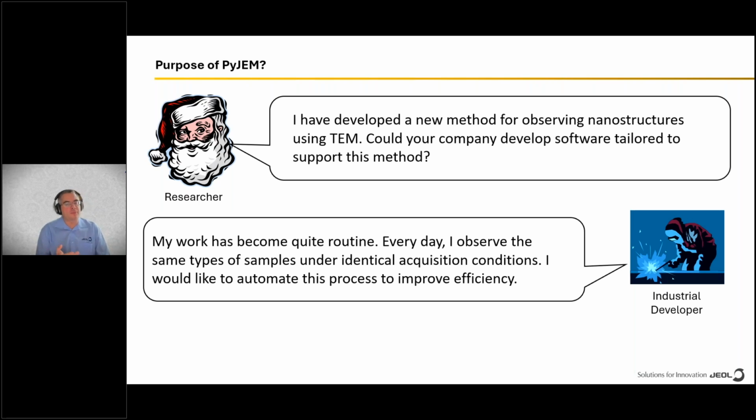giving access to control the microscope and write scripts that will control the microscope. When to use PyJEM? Well, this depends on your background. If you are a scientist working at a university, you may have expectations or requests to develop new software packages. A quick biological context: imagine a histopathology sample, a thin section, and you want to quickly calculate the number of cells trapped in that particular section.